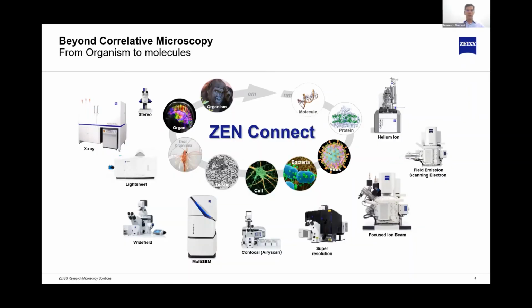We have a lot of products, but we don't cover all. We've just seen, for example, AFM that brings some information, and we do not make AFMs, but the data must be integrated into the context.